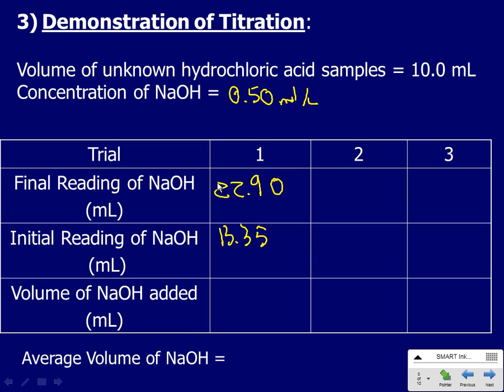We're going to add some of the good phenolphthalein. Okay, there we go. I'm going to add some water so I can swish it. Swirl it. That's good.